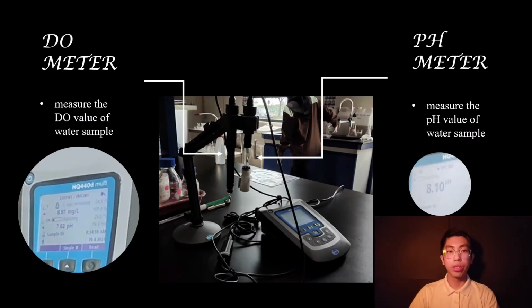Next is the DO meter and the pH meter. Both use the same device but different probes. The DO probe is black in color, as we can see in the slide, and the next one is the pH probe. The DO meter is used to measure the DO value of the water sample, and the pH meter is used to measure the pH value of the water sample.